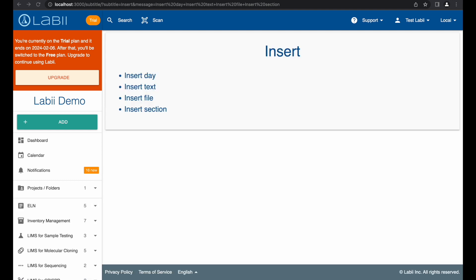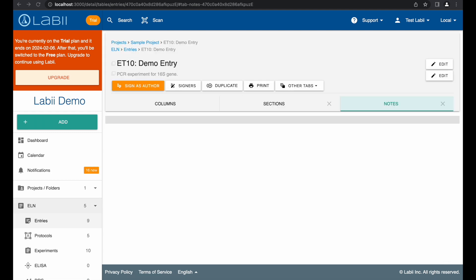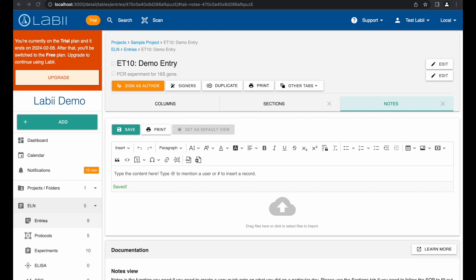Labii ELN editor offers some unique features that no other editor can match. Specifically, you can insert date, insert predefined text or experiment template, insert or upload file documents, insert or create new sections with any widgets. First, you can insert the day by clicking on the Insert menu and then choose Day.